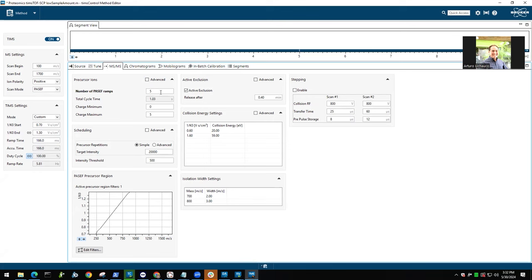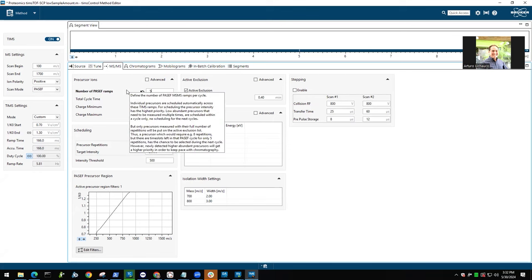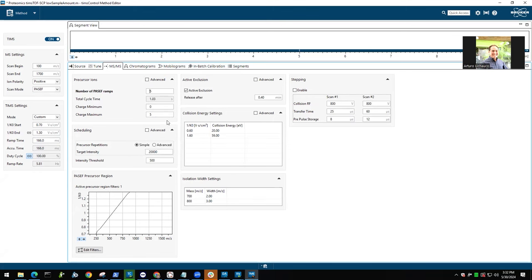Because then your cycle time is massively reduced, right? So it was 10, so your cycle time is 1.9 seconds. At a half hour gradient, you are pushing it already. So that's why I typically use 5. So your cycle time is around 1 second. And when you change this one to 100, you're at 0.64 seconds cycle time. So you're picking up more precursors. And I think the signal intensity is already high enough, especially on an Ultra system.